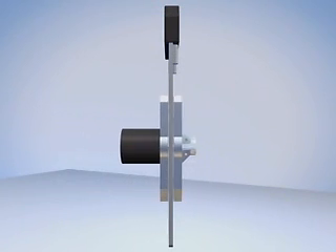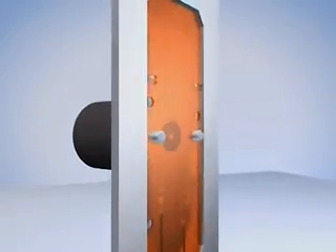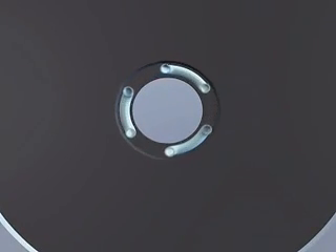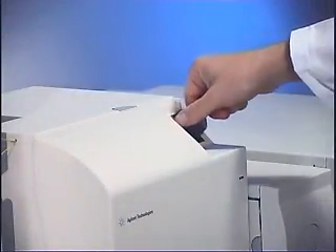The rotor and stator dock onto the chip and establish a flow path from the nano-LC to the ports on the chip surface. Fast movement of the rotor ensures reliable switching between sample loading and sample analysis positions on the HPLC chip. Replacement of the HPLC chip is simple and can be completed in a few seconds.